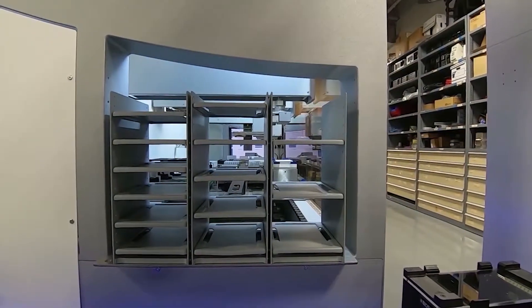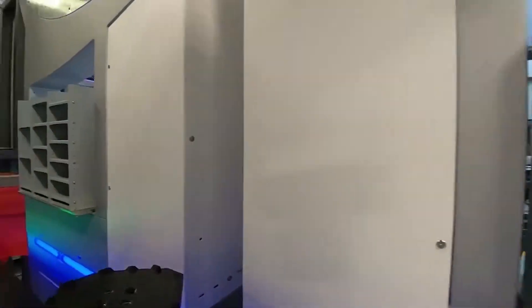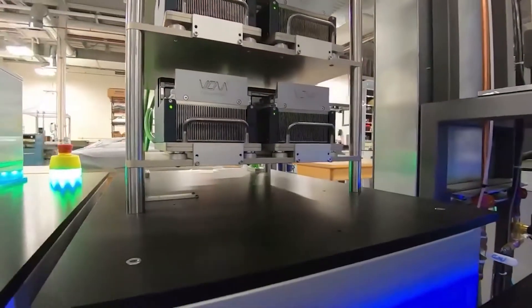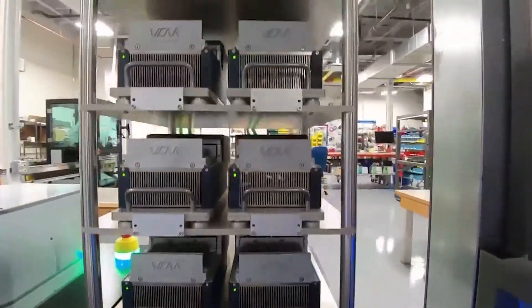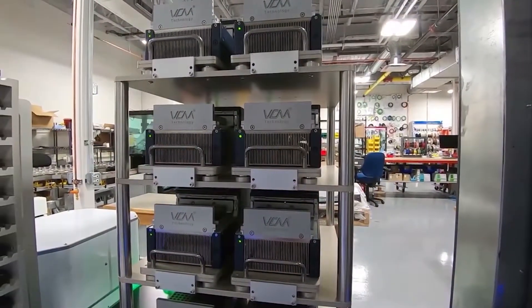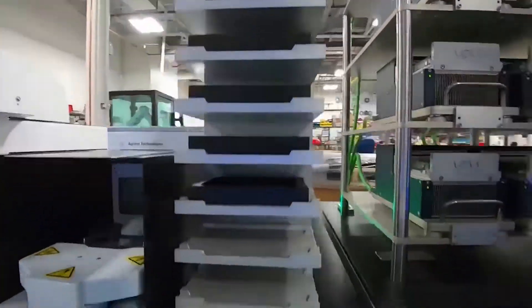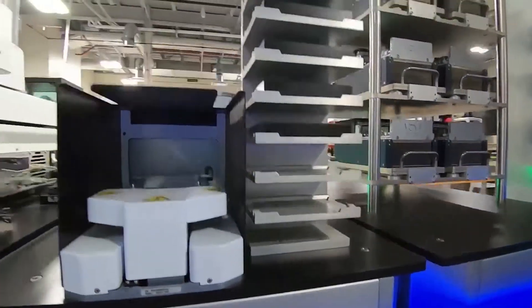We have components above and components below doing all the different work needed for NGS prep. Coming up here is our stacker of eight on-deck thermal cyclers that were taken off the deck — this was to free up our Tecans to do a lot more processing instead of being tied up with thermal cycling.